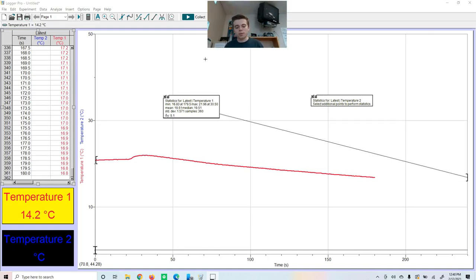On each of these questions, I want you to theorize as to why it is like that. I know it's a temperature change, but explain the temperature change, and also explain why it is bigger. Especially in our first trial, they're both just dispersion bonding, but why is one molecule stronger than the other? For question four, I want you to talk about why you think water has such a small delta T value. It is hydrogen bonding, but why is it so much smaller than other hydrogen bonds?